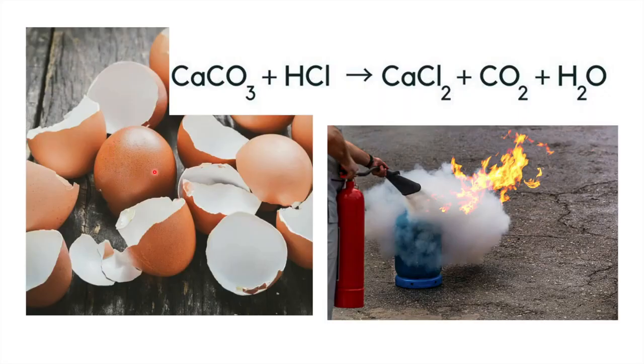So friends, we know that eggshells are made up of calcium carbonate. When calcium carbonate reacts with hydrochloric acid, it gives you calcium chloride, carbon dioxide and water. So we know that carbon dioxide is a gas.